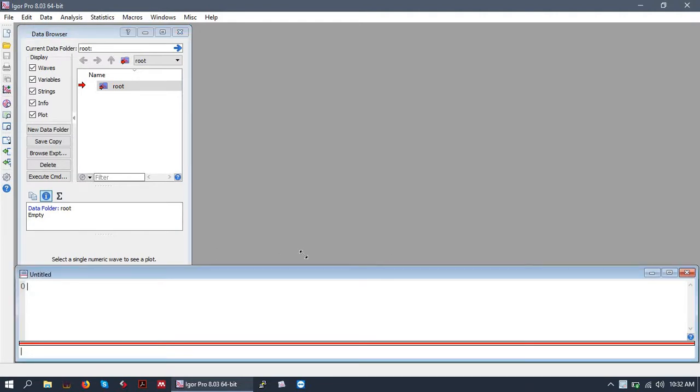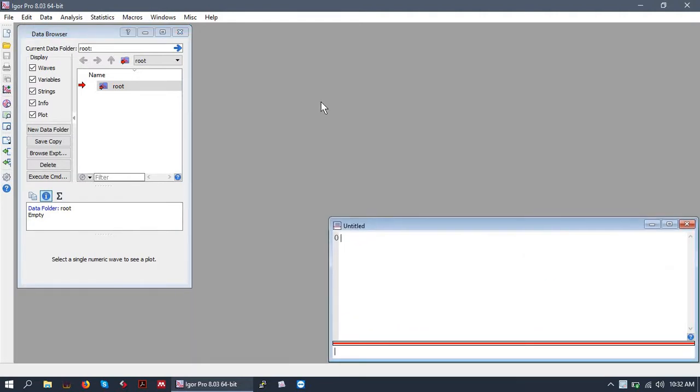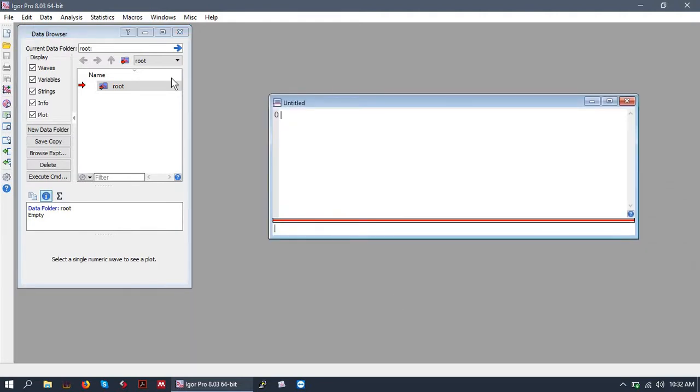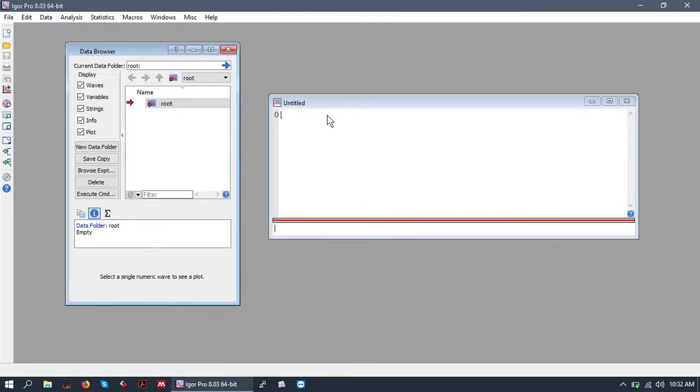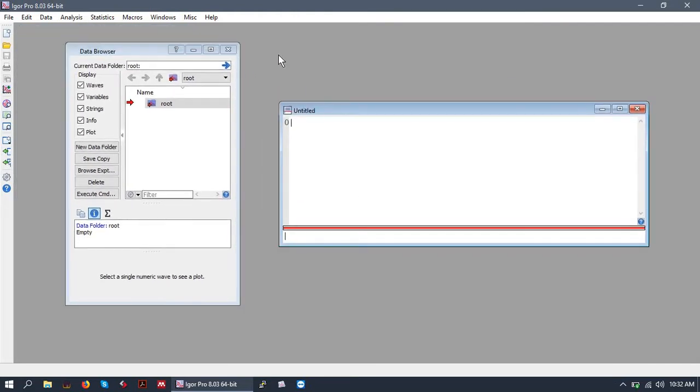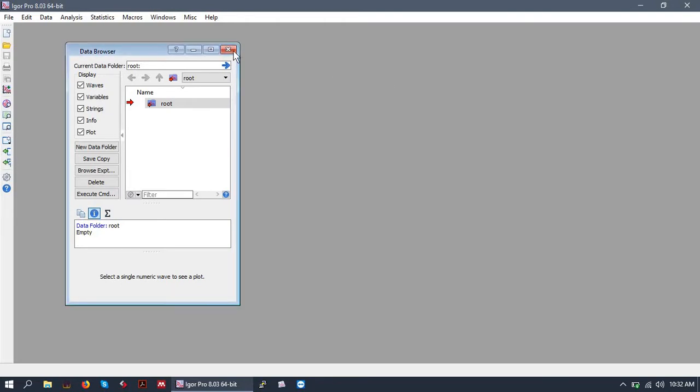As you can see, my Igor opens up a data browser and a command prompt as the default windows in a new experiment. Let's go ahead and close those so we can discuss how we open them.